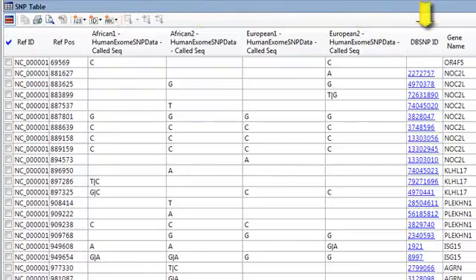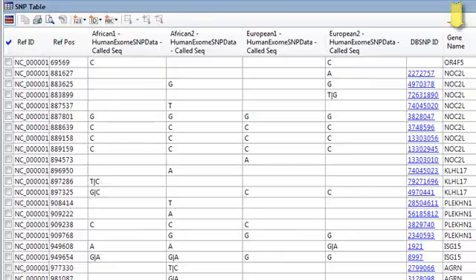the dbSNP ID, and the gene name. So what this gives us then is the breakdown of SNPs for each sample at each of the positions listed.